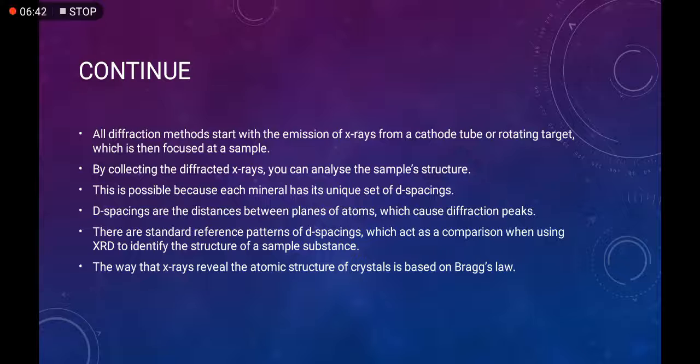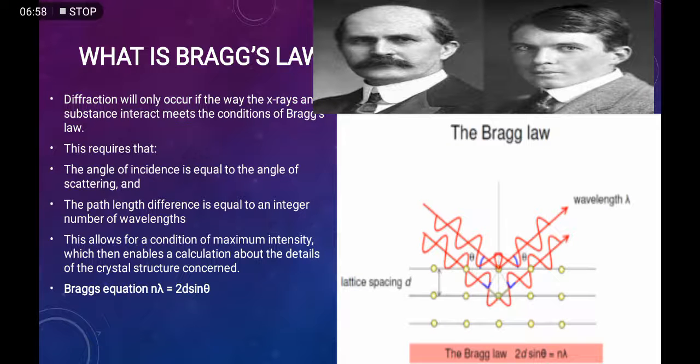There are standard reference patterns of d-spacing which act as a comparison when using XRD to identify the structure of sample substances. The way that XRD reveals the atomic structure of a crystal is based on Bragg's law. What is Bragg's law?